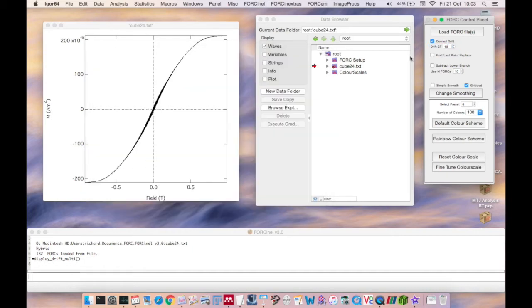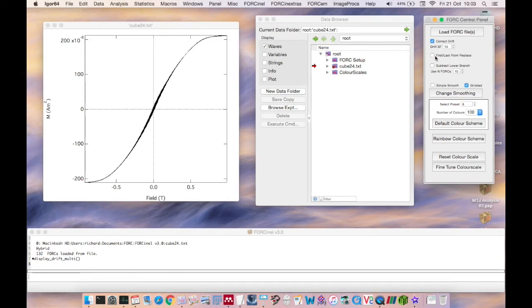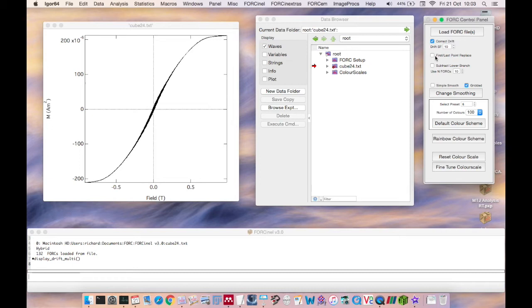The second option is First Last Point Replace. This option removes the first and the last point on each fork curve. Due to instrumental reasons, the first and last points of each fork curve are often observed to lie off the trend defined by the other points. This can often lead to strong artifacts in the processed fork diagram. Removing these points from the smoothing process can often solve this problem. For now, we'll leave this unchecked.